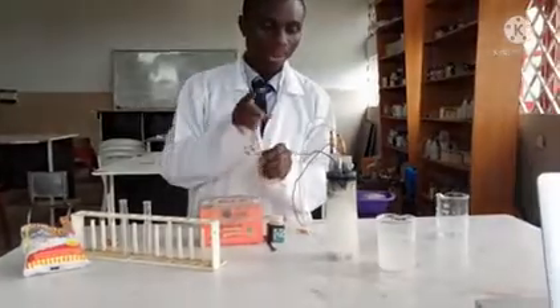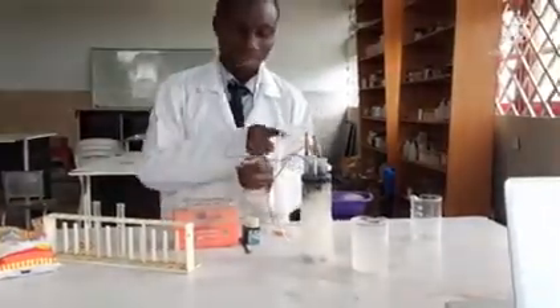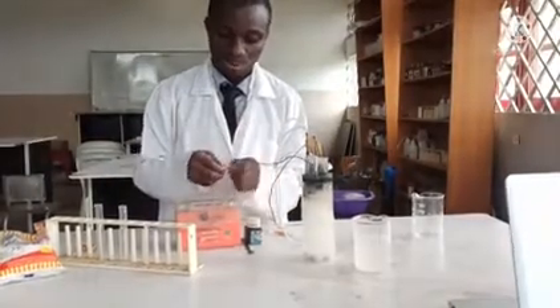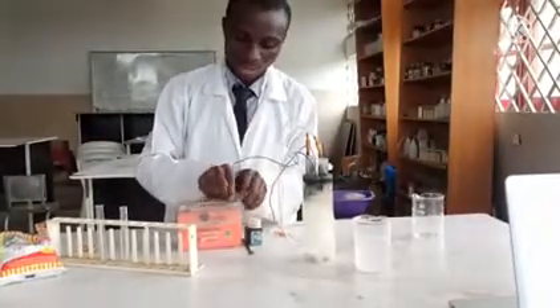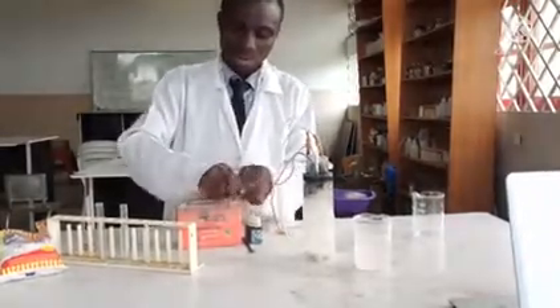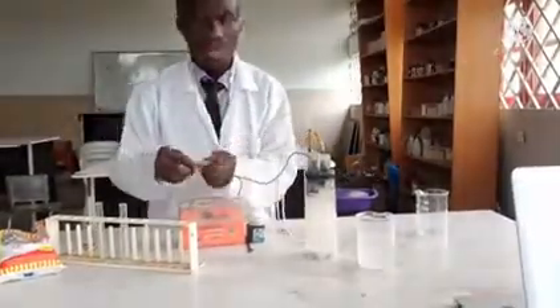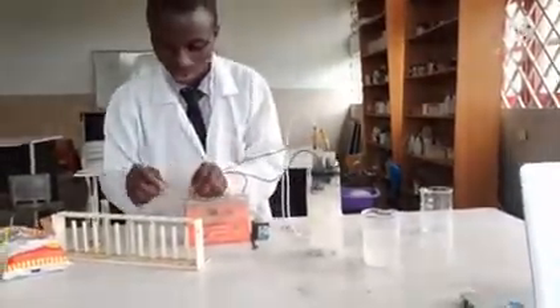The electrode that is going to produce chlorine I'm going to connect to the positive part of the battery, while the part that will be producing hydrogen will go to the negative part of this battery.